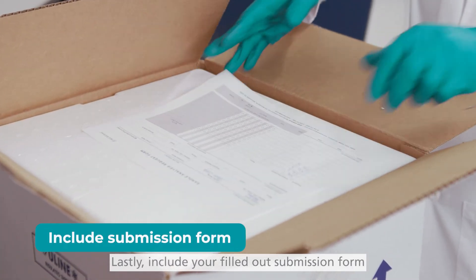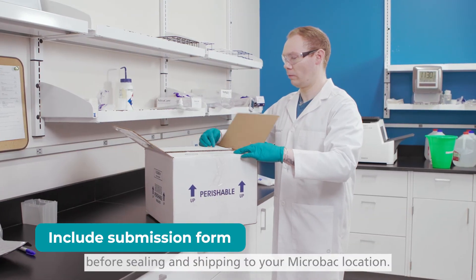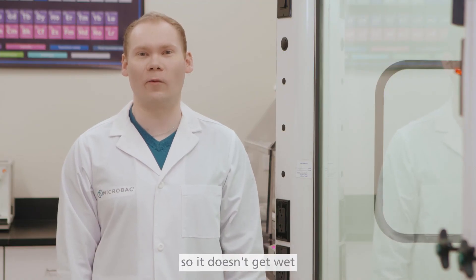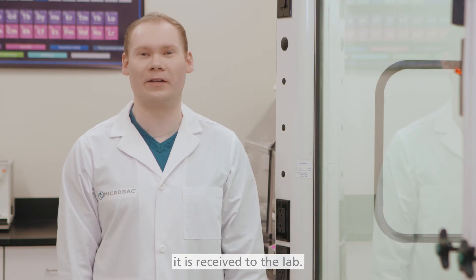Lastly, include your filled out submission form in the packaging before sealing and shipping to your micro lab location. Make sure to protect it from cold packs so it doesn't get wet and is still readable by the time it is received at the lab.